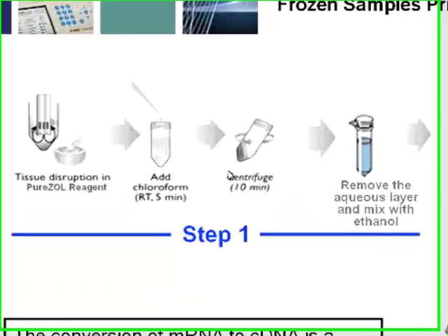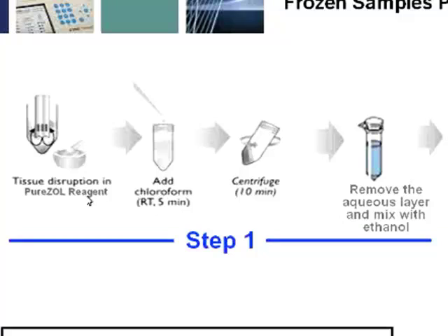I do recommend kits for doing the RNA extraction, only because kits provide you with lot verified material that's not contaminated with RNases, so you can rigorously extract RNA. Bio-Rad sells kits as well as other companies that are good kits, and you can talk to your local Bio-Rad rep for recommendations with respect to what type of kit you would need for your particular type of sample.